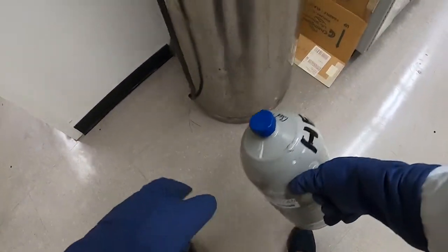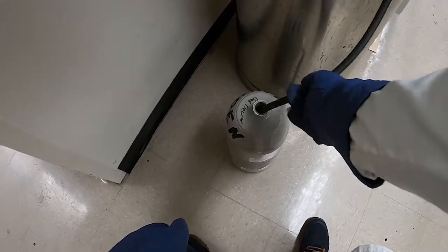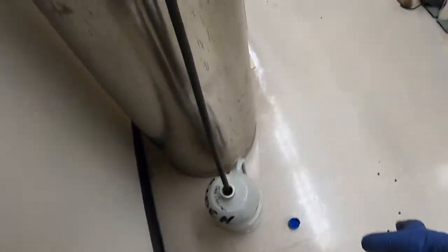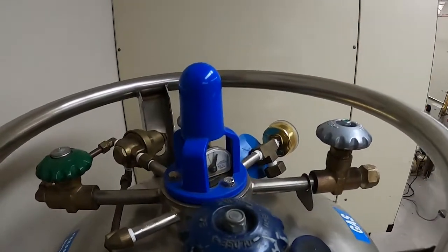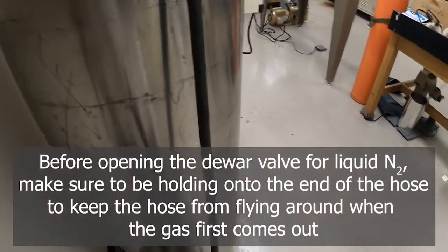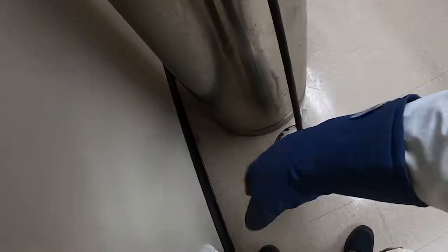Our first step is to take our handheld Dewar and put our rubber hose in it. Then here on the top of the canister there's a valve for the liquid. We want to open it slightly, but with our other hand we want to be holding onto this tube, because when the gas starts coming out it might make the tube go flying out and go all over the place.